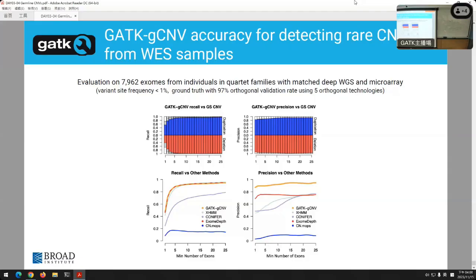My second question is, for example, my reference genome is a non-human draft genome, and is the copy number variant state of the draft genome important for GCNV to identify the copy number states in all the samples when I use the reference sample to map them? Okay, let me address your first question first, except that I forgot it. Can you repeat that? The recommended sample size and the coverage depth of the sequencing reads.